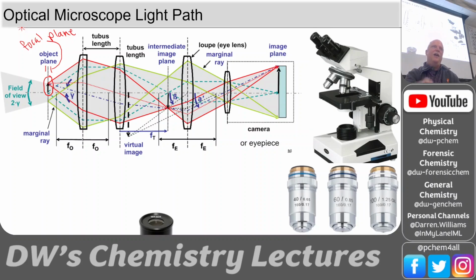Okay, and so it always takes some checking at the beginning. You go all the way down and all the way back up and see where all the different planes are in your sample. These different lenses will take that image. There'll be an intermediate image here. It's typically upside down, and then you'll bring it out here to the image plane. Now you can replace this camera with an eyepiece, and you can put this image plane on your retina.